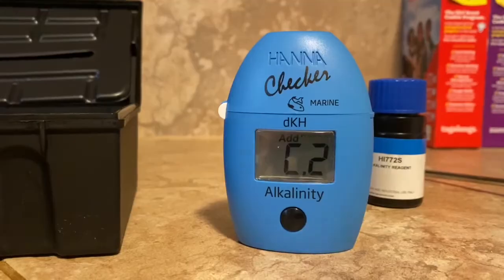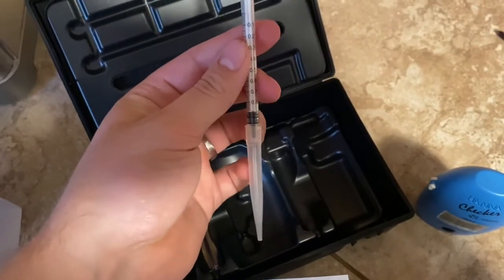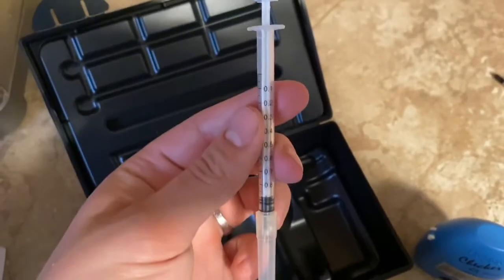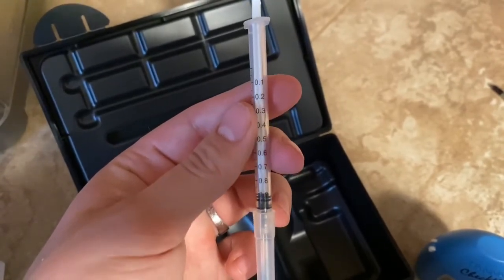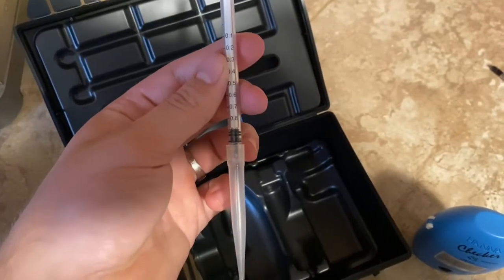Here is the syringe with the tip added. If you're not familiar with this type of syringe: we're going to draw one milliliter, which takes the plunger all the way up above the 0.1 mark. The reagent is not going to go into the actual syringe barrel — it's only kept in the tip. So don't attempt to draw all the way up into the syringe or you'll have too much reagent.